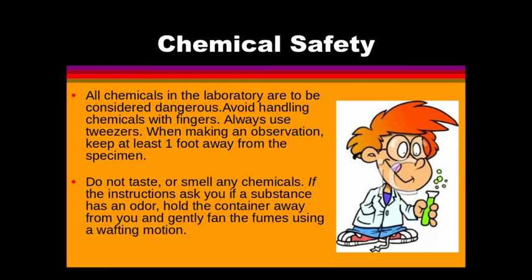Quite frankly, most of the chemicals we're going to use in our lab are not hazardous, but we need to get in the habit that they are, because eventually they will be, and we need to get into that practice now. So never touch, never taste, never drink, never smell any chemicals unless the teacher says it's okay. Never put your nose into a container.